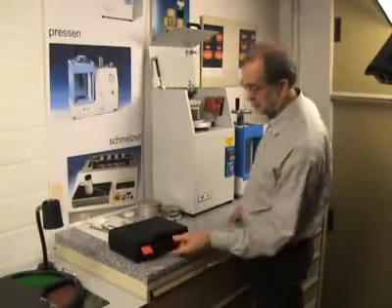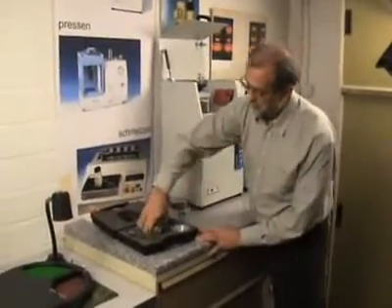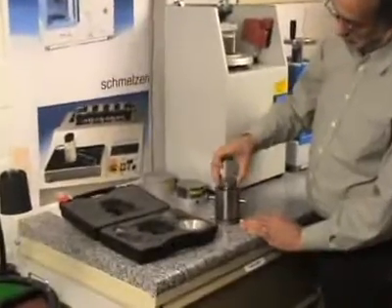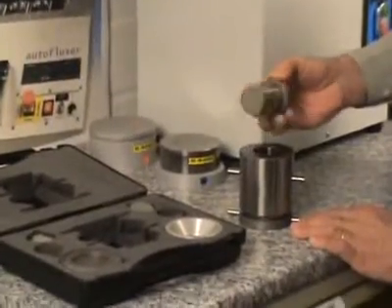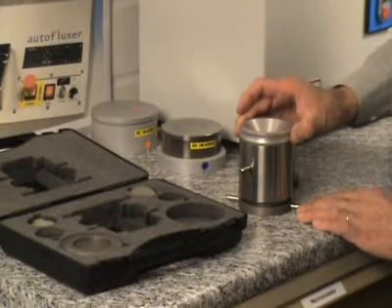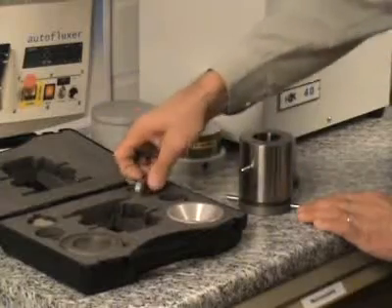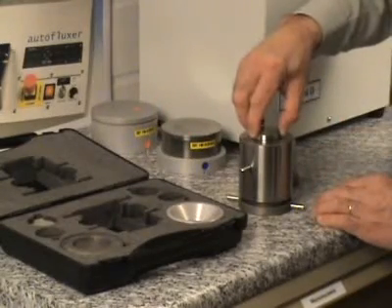Here we show a more comprehensive die set made of fully hardened tool steel. The piston features grooved notches for ventilation. The cylinder and base plate are of screw plug type and a funnel can be put on top. The set contains four polished plates.